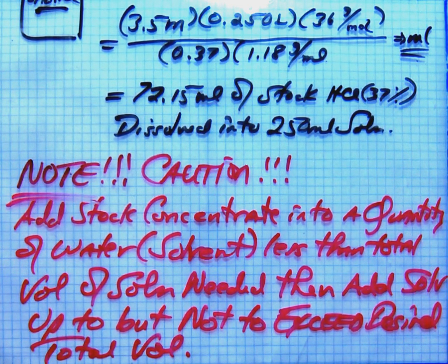And I kid you not, it will take your face off. When I first started, one kid put the acid in first and poured the water on it. It didn't hurt her, but it blew out and left a big old spot on the ceiling. I swear to God. Had she been looking down into it, she'd have gotten it in the face. Please take that to heart. Thank you.